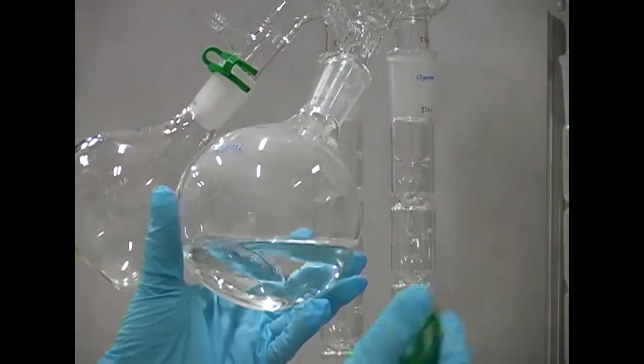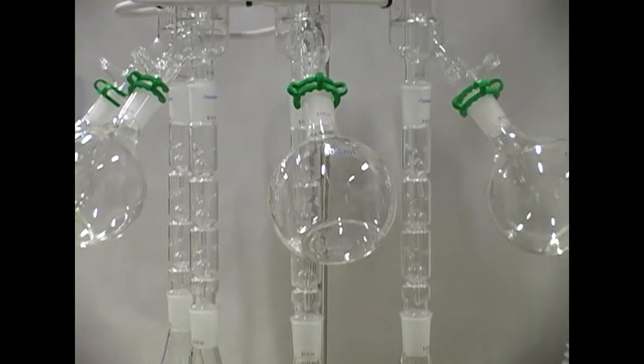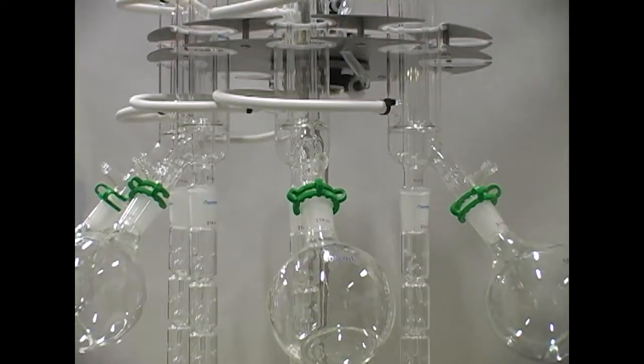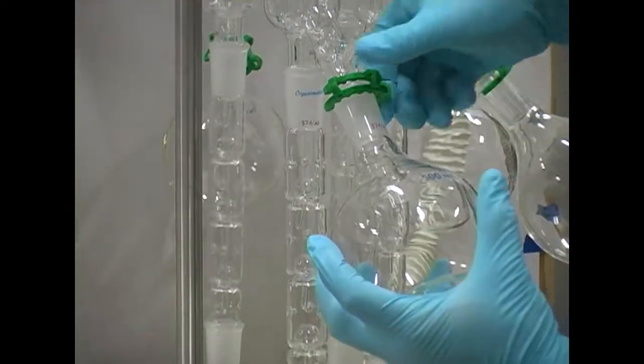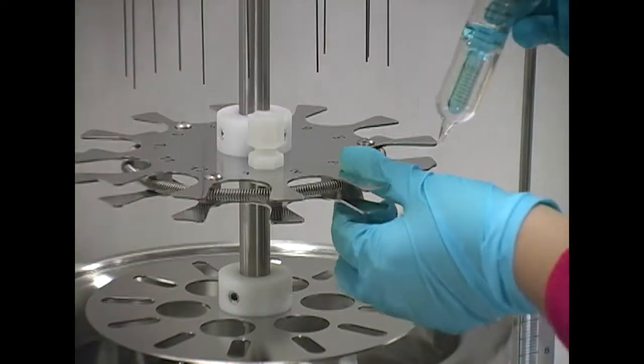The green clips allow the collection flask to be removed with ease. This instrument features an easy to empty collection vessel at each sample position. Solvent from each sample position can be discarded appropriately.